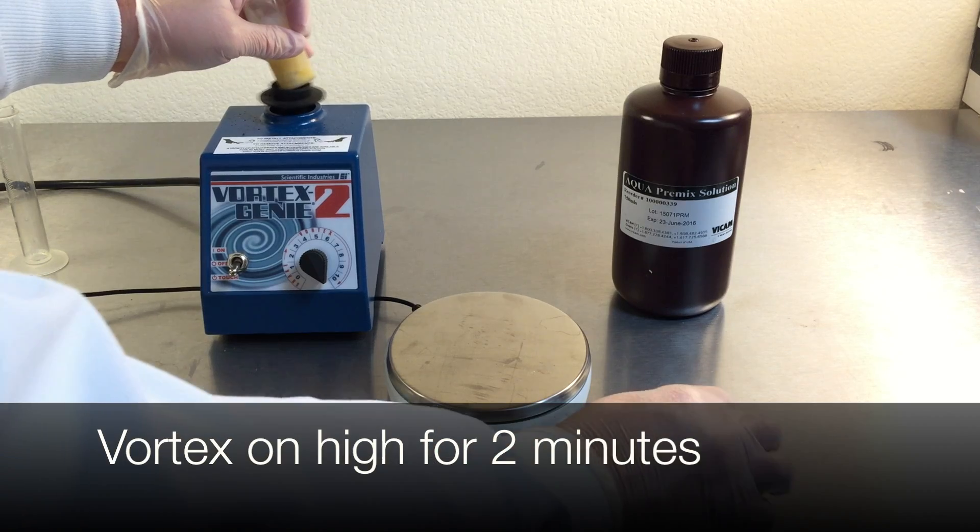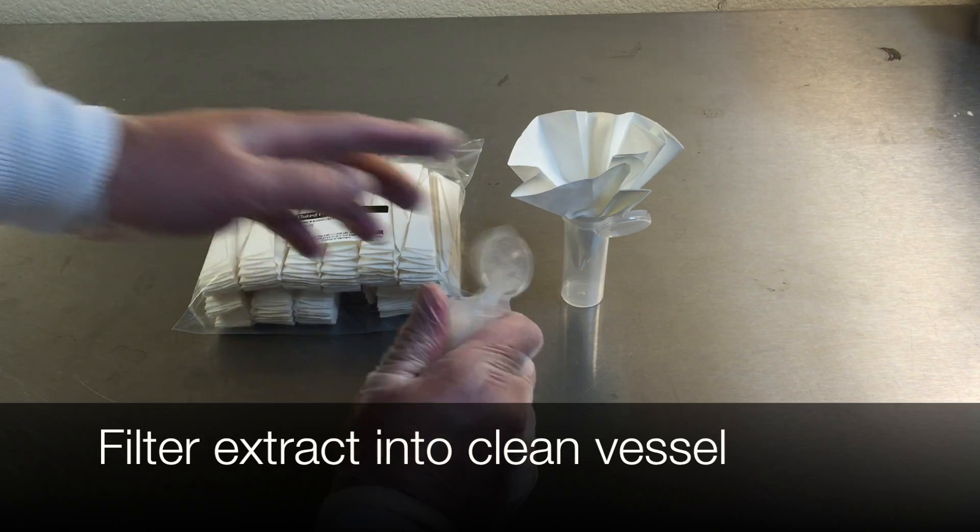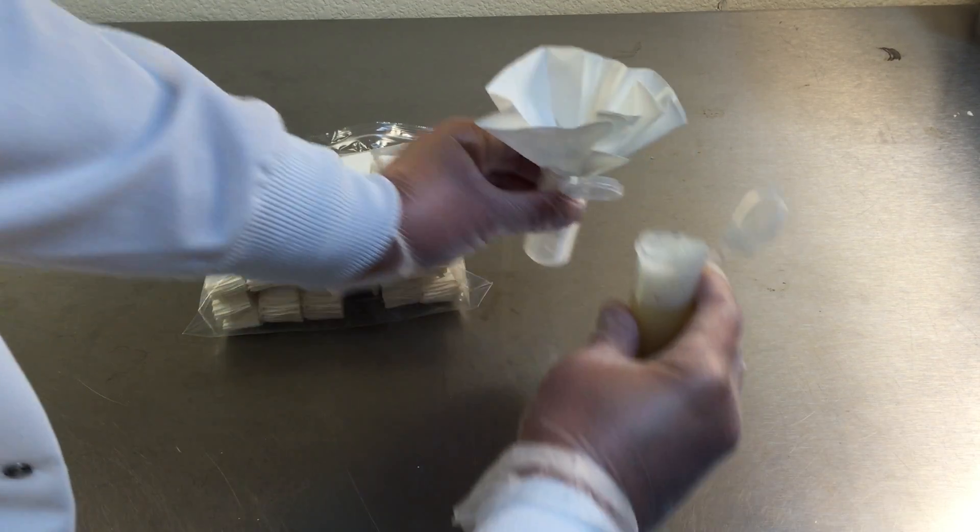Vortex the mixture on high for 2 minutes. Filter the extract through the paper filter into a clean extraction tube.